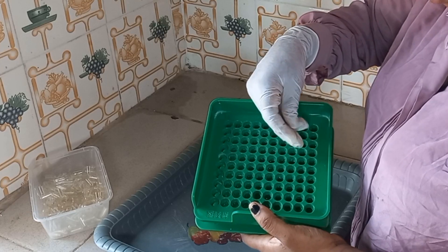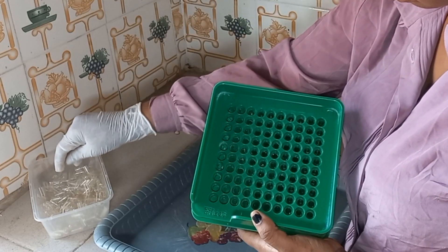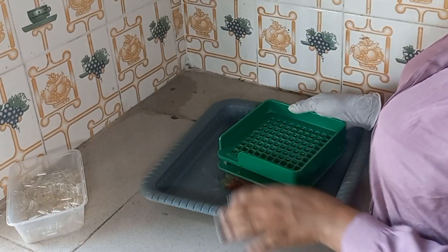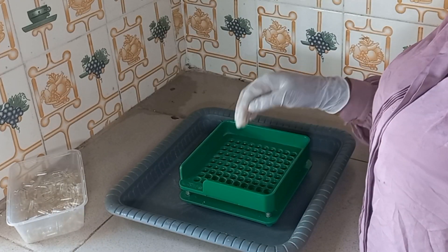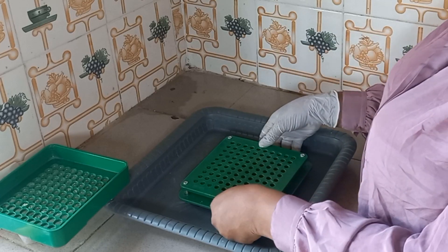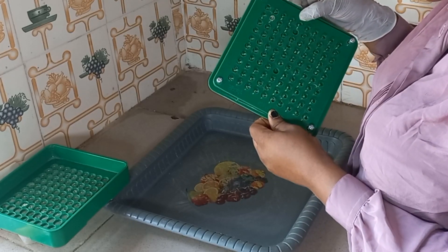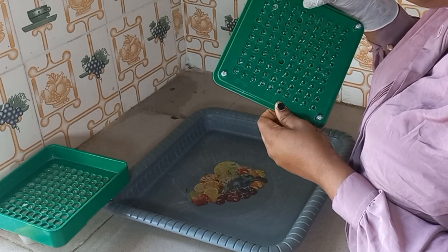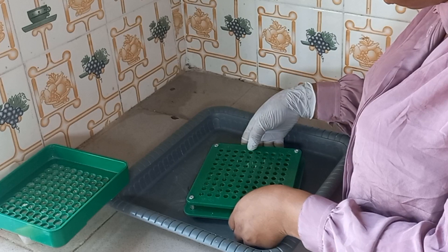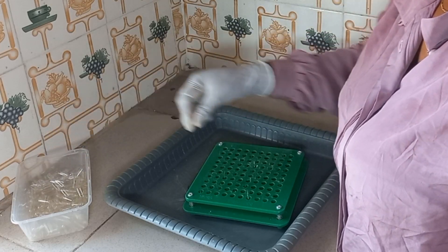Check row by row. Now that I've put everything inside the mold, we'll check if there is anyone that is upside down. You just have to put it down correctly. Everything seems properly placed, but there are still two holes that don't have capsules in them, so just put them in.